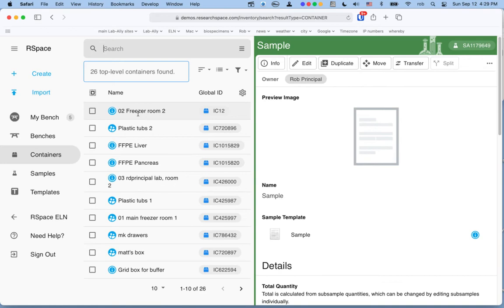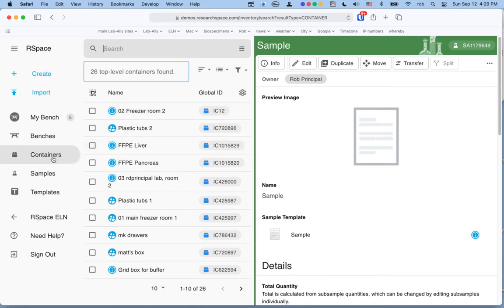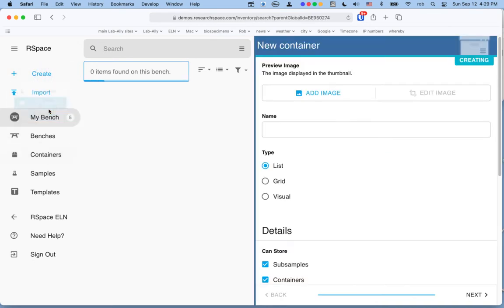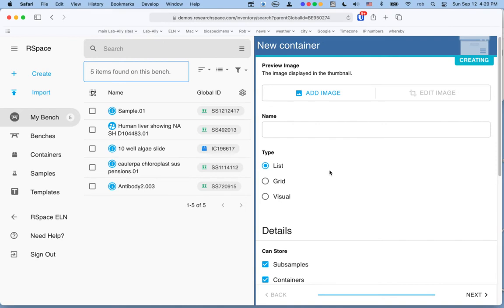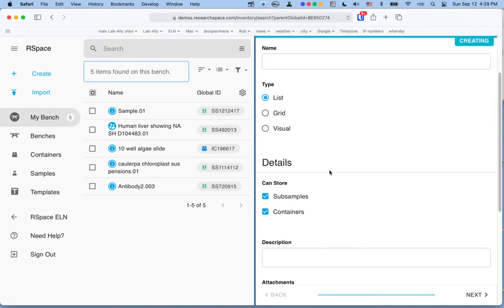And these will be things like your rooms, your main freezers, your primary storage areas, sets of shelving, cabinets, the sorts of things that everybody in the lab will use. And then once you've set those up, you can then encourage the individual users to make their own subcontainers within that container. To make new containers, you're going to say create, container. And if you're making one that's going to be a top-level container, we'd typically recommend that you set it up so that it only contains other containers.